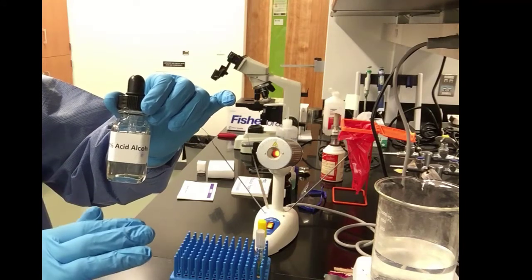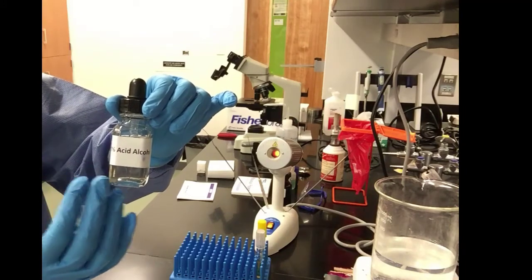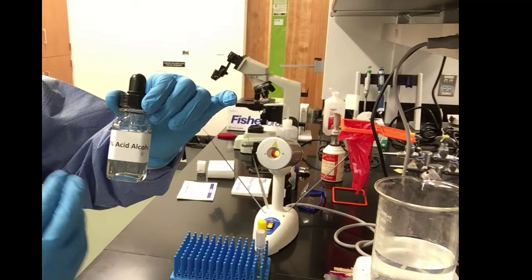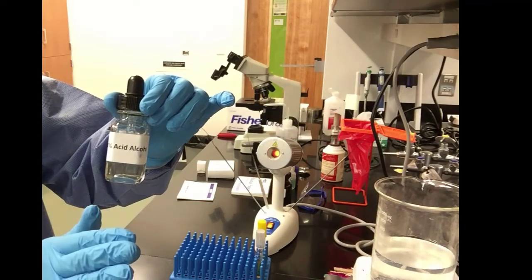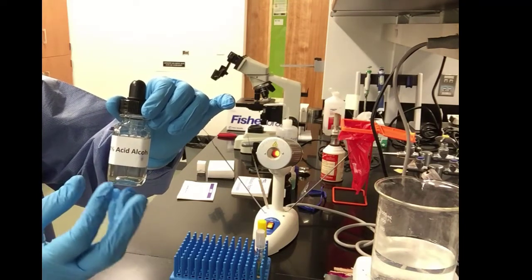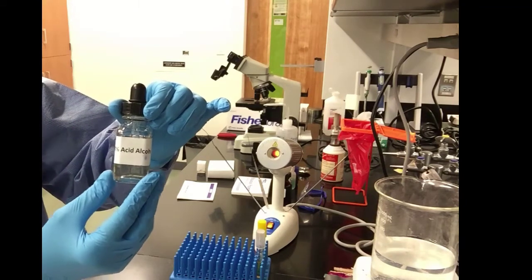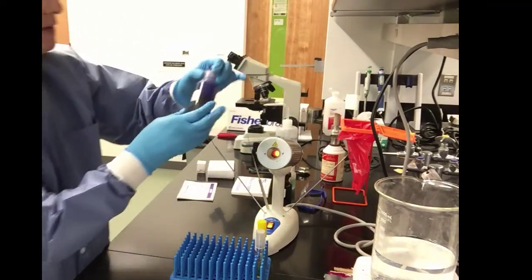We do not use ethanol directly because we don't want to degrade the lipids that are in the cell membrane of the Acid-Fast positive bacterial cells. So we use acid alcohol in order to preserve them, but again decolorize the cells that are not Acid-Fast positive. So the acid alcohol retains the lipids and allows for the staining procedure to continue.